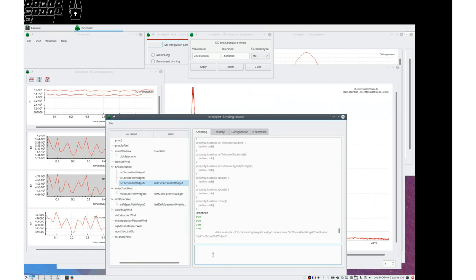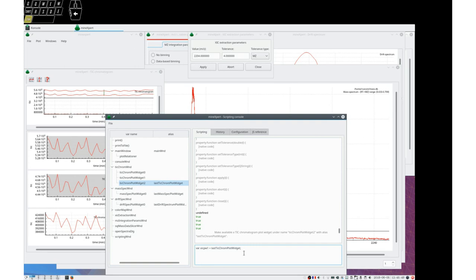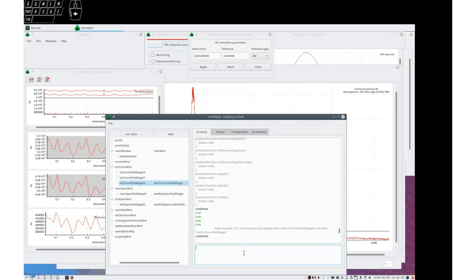So all I have to do, I know that I generate a tick chromatogram plot widget. Now I know this variable is correct. I can check that by saying hide.